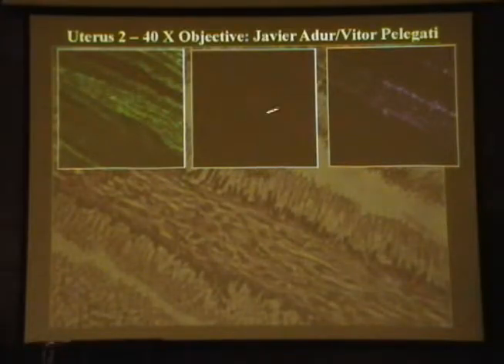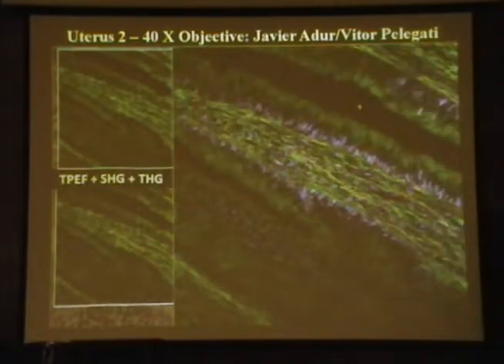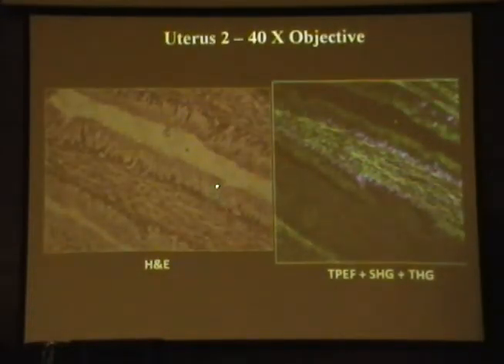You can take all these images in different detectors, so they are separate, and you can mix them: fluorescence with second harmonic, fluorescence with third harmonic, second and third harmonic, and then we can put everything together so we can look in terms of colors at least. We have a much nicer image than the normal one that they look at.